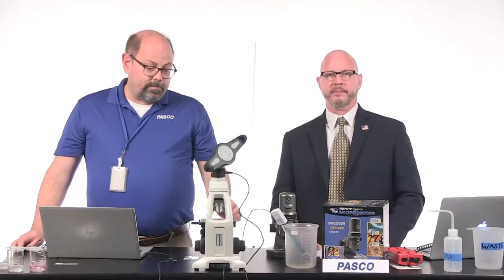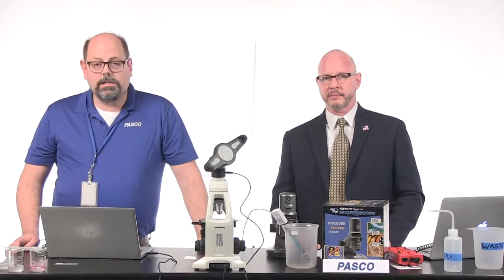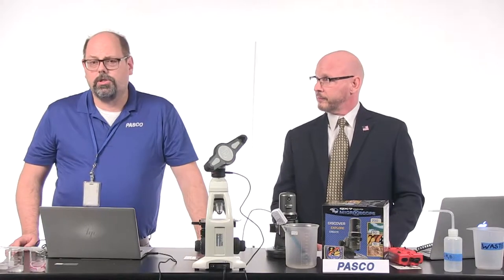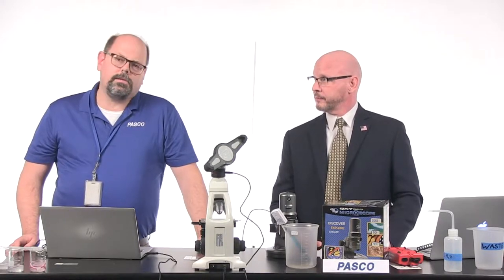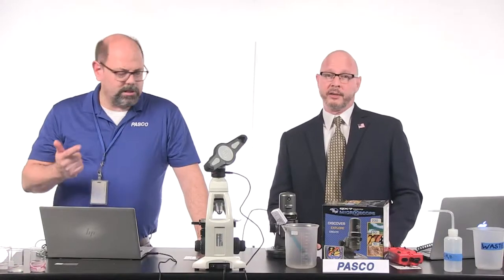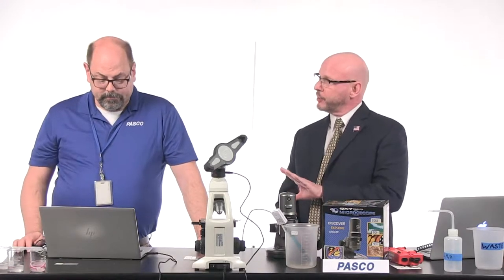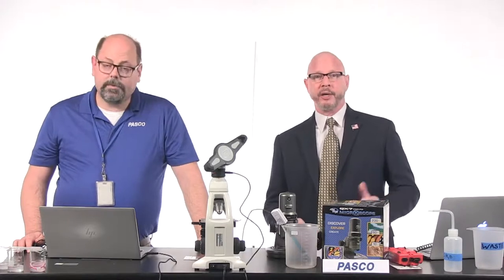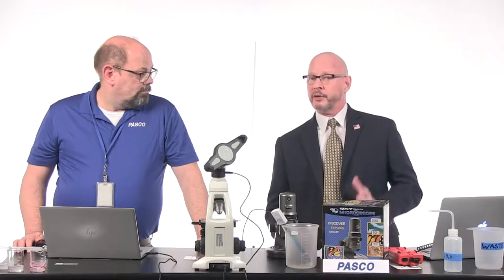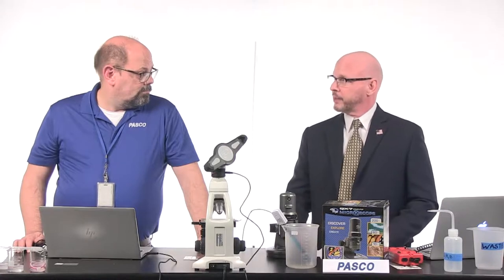microscopes? Correct. As you see, we're just coming in through a USB port, and so if those are recognized in your operating system, then it'll become camera two, like I did at the beginning of this last section to show you the live hookup of that system, and it'll pull those images in. So the first thing is to recognize it, and then the second step is to go ahead and capture. In any case where my computer recognizes the digital camera, I have found that SparkView recognizes the digital camera. It communicates through the computer itself. So absolutely, try it with your digital camera, and remember, the software is free for download for a 6 month trial version, so just download and try it and connect, and you'll see that.